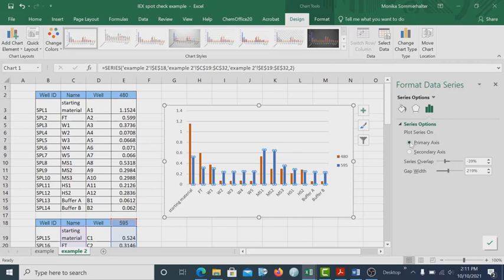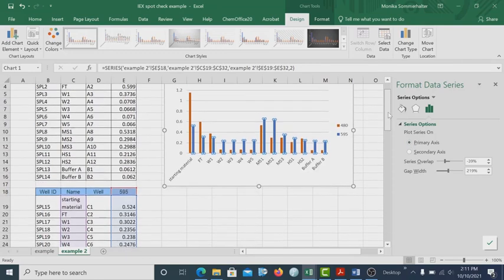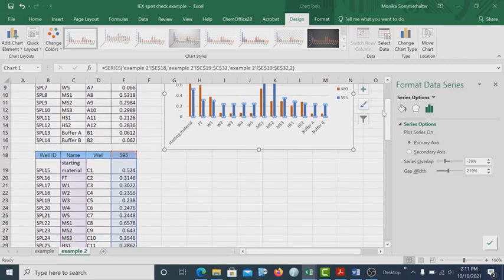However, it might be worth considering adjusting a baseline, because the Bradford reagent itself absorbs light somewhat at 595 nanometer, and you can see that buffer A and buffer B, which should not contain any protein, it's just an aqueous solution with Tris with and without salt, so no protein.